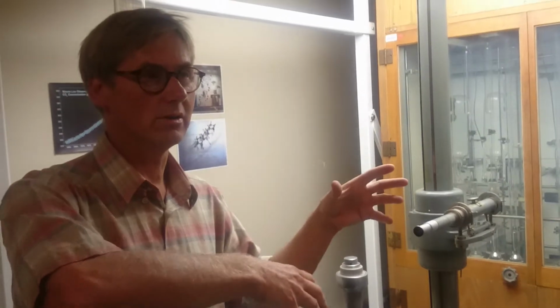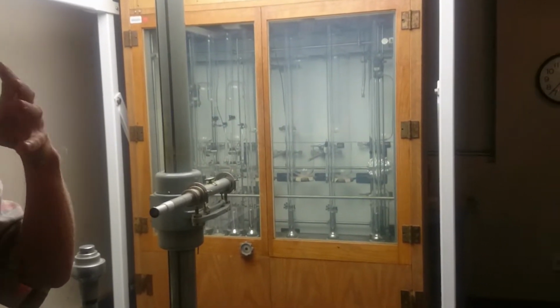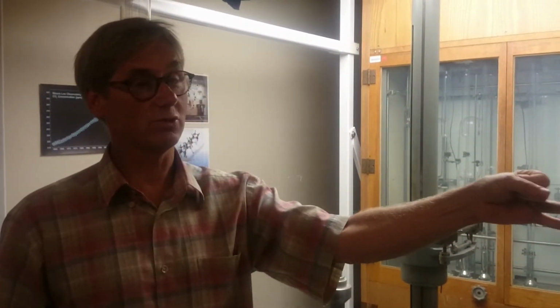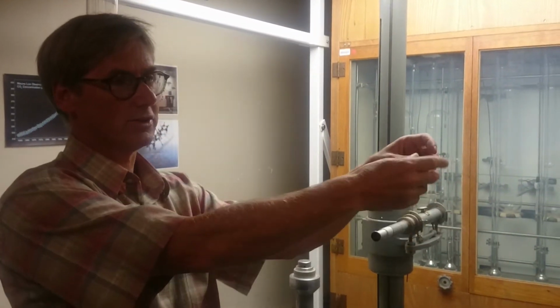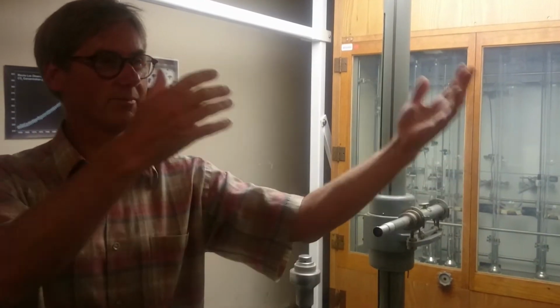And so it was simple. You take an air sample, first you get rid of the water by freeze drying it out. You pass the air through a glass tube that's cooled down to dry ice temperatures, and that'll pretty much take the water out. And then you take that dry air, you introduce it into a known volume, you measure the pressure and temperature, so you get the number of moles. Then you pump away the air to freeze out the CO2 on liquid nitrogen, which was newly commercially available. And then you measure in a smaller volume the pressure, temperature, and volume of that smaller. You get moles divided by moles, you get the mole fraction.